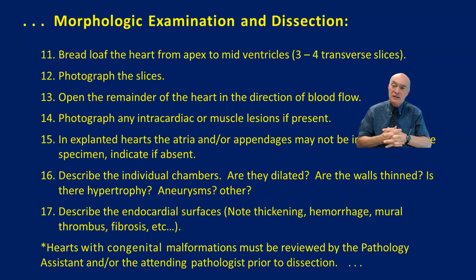And then there is a very interesting pathology called arrhythmogenic right ventricular dysplasia, in which the presence of fat in the wall of the right ventricle is going to interfere with the normal physiology of this muscle. So also take pictures in these situations, in close-ups, and also describe all the appendices, the atrium, and describe where the section has been made to remove the explant, because the rest of the atrium is going to remain in the patient, that is going to continue producing the pacemaker function for the transplanted organ.